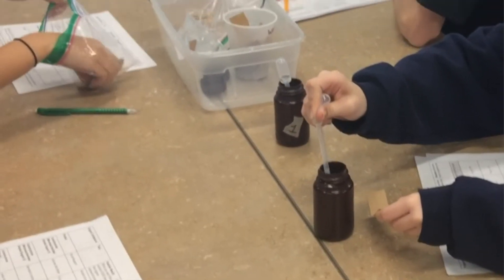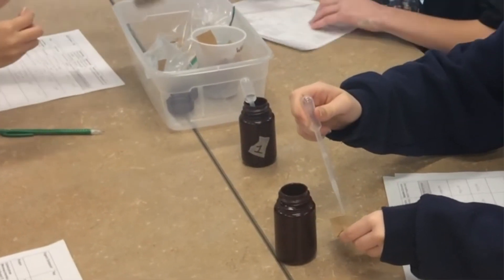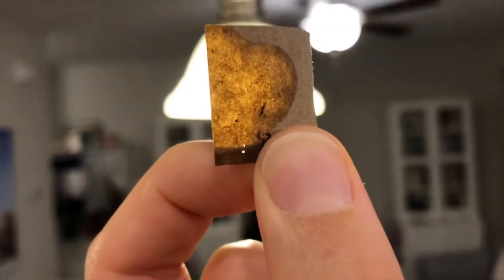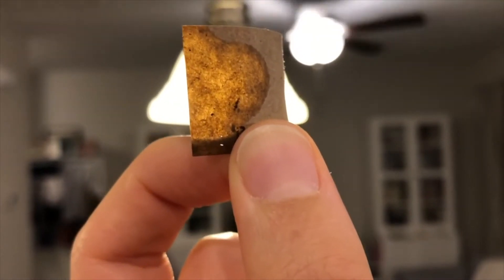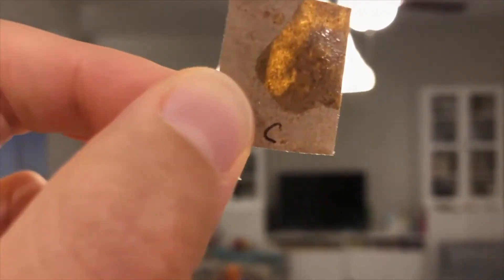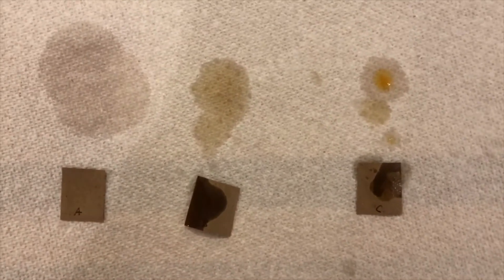Next up, if you're testing for the presence of different organic compounds in foods or beverages, you can test for lipids using just brown paper bags and a dropper. This is a super easy way to introduce organic compounds and indicator tests, and if lipids are present, you should see the paper turn translucent after it dries.